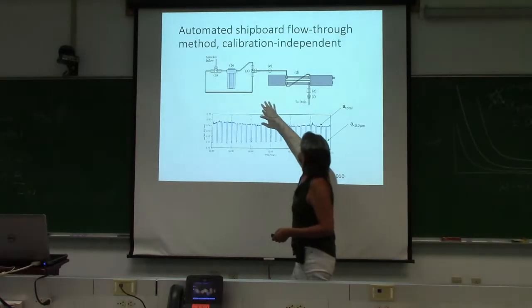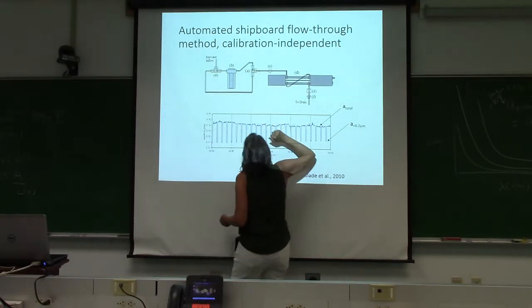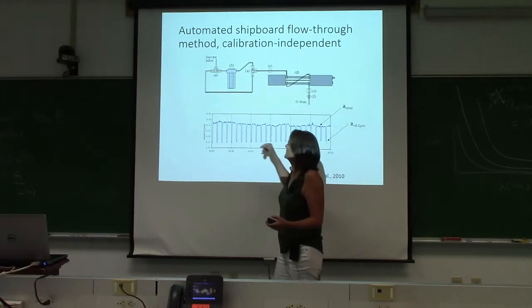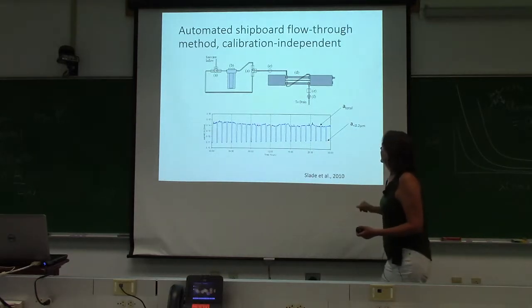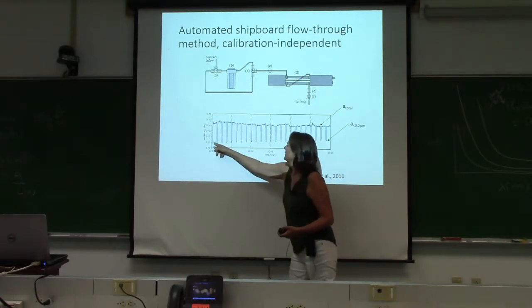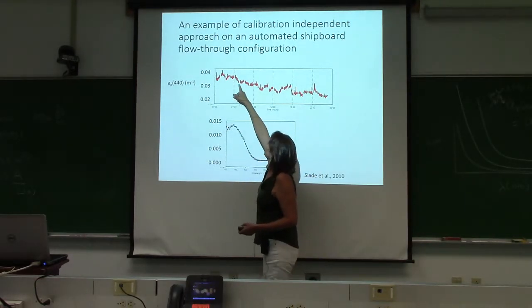So they set up a flow-through system where the water could come in and go directly to the AC9, or you could switch it and it would go through a filter and then through the AC9. Measured absorption as a function of time, which is also distance. Total sample, filter kicks on. Dissolved sample. Total sample, dissolved. And you just do that over time. And then you can interpolate between here, you can interpolate between here, you can subtract this from this. You get your particulate absorption, and look at this.